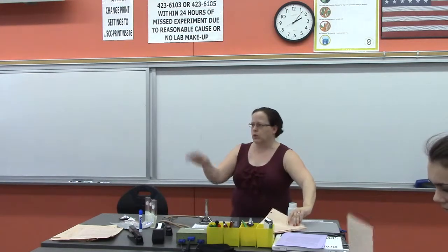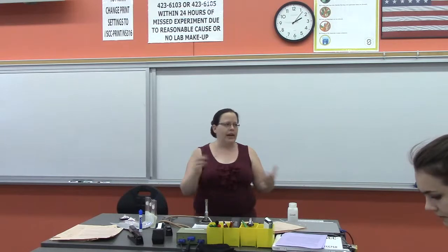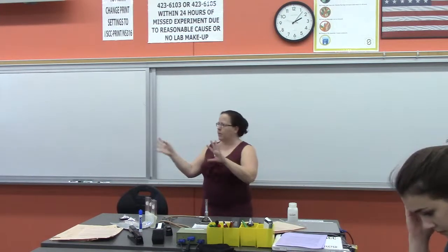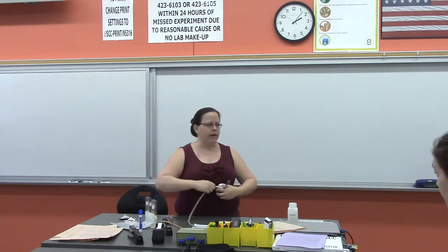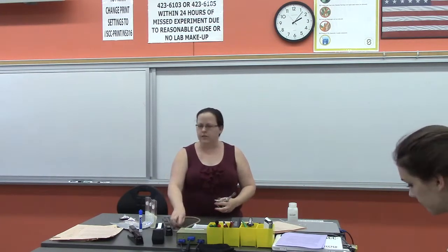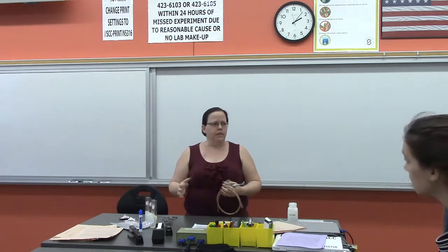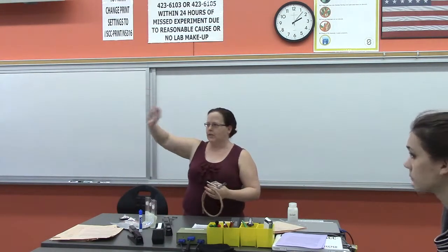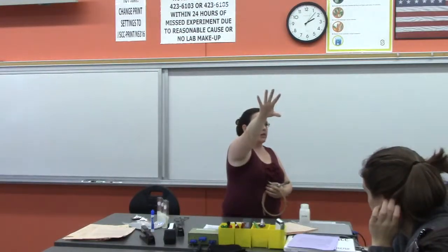It's a lot of doing experiments, writing down observations. You are going to have to do dishes a couple of times in between to clean things up. I'll be walking around, keeping an eye on you, asking questions. Every time you finish a section and you're cleaning up, remember if it's blue or had the silver in it, it goes in the fume hood on this side. All other solids and liquids go in the back.